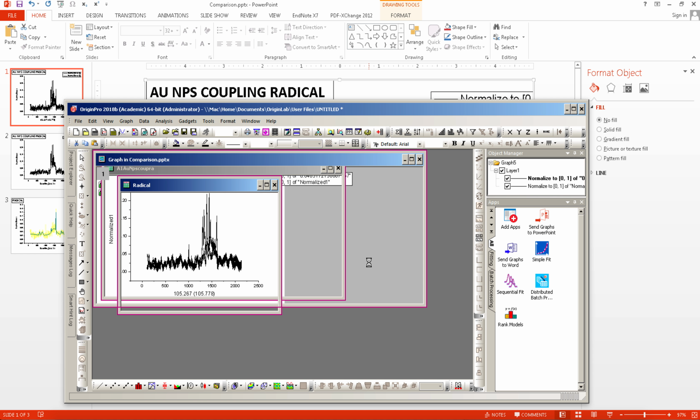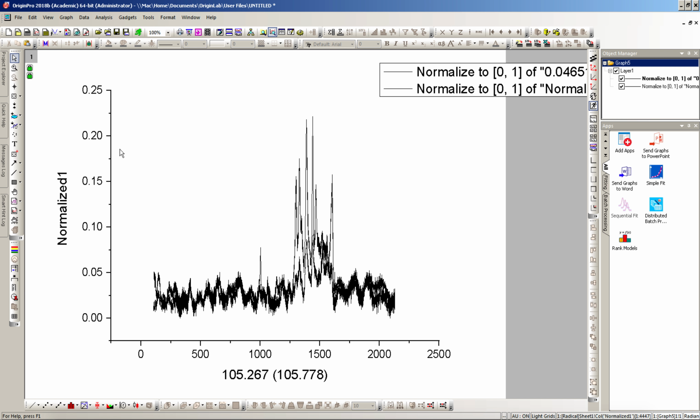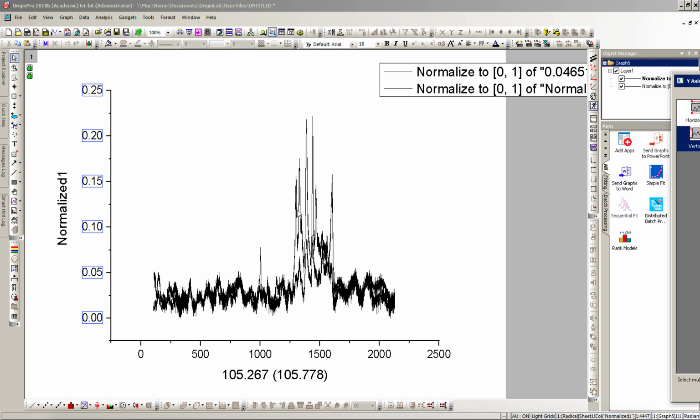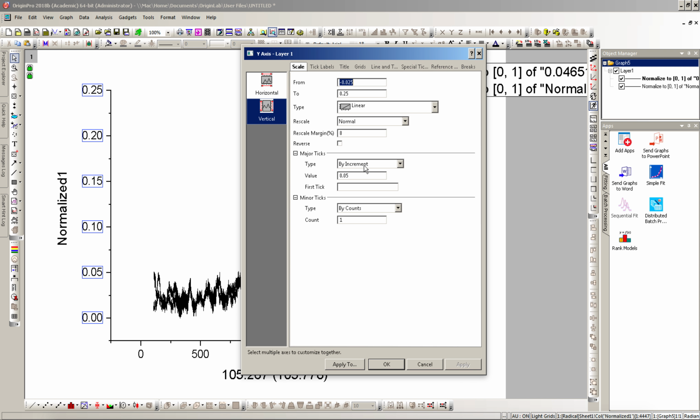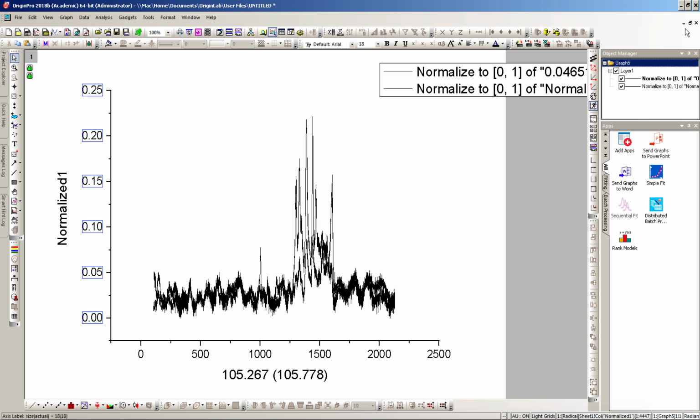So you see that I'm already there where I have both, but they are the same color, and I also want to fix the axis and the names. And for some reason, it's supposed to be normalized, but it still doesn't look normalized, and this is very weird. There should be a problem here. So I'm coming here, take labels. It should be okay. I don't know why it's showing. It's supposed to be normalized and it's not, obviously.